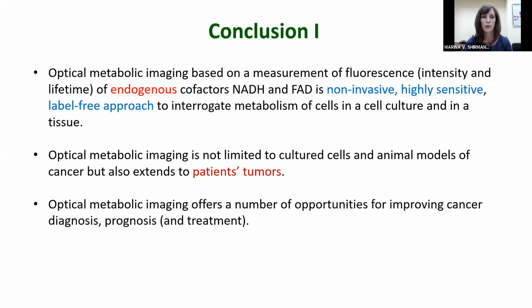Optical metabolic imaging is now not limited to cultured cells and animal models of cancer, but also extends to patients' tumors. And the last conclusion, this method offers a number of opportunities to improve cancer diagnosis, to prognose cancer development, and for monitoring of treatment efficacy.